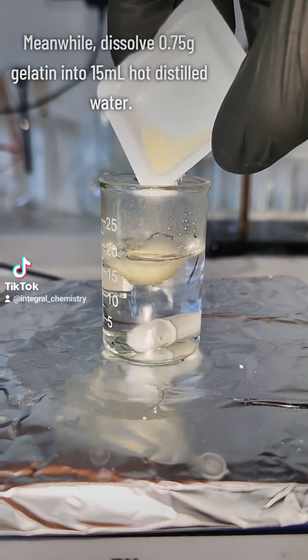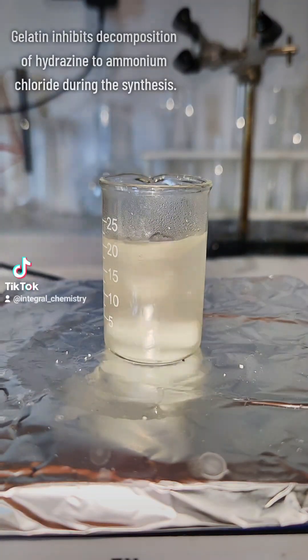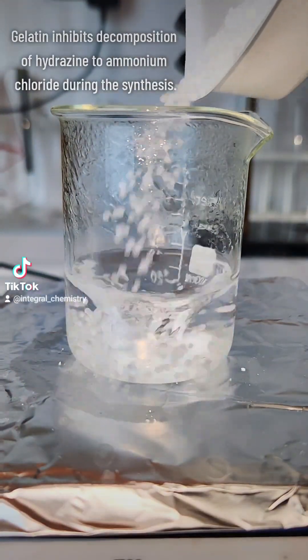I dissolve 0.75 grams of gelatin in 15 milliliters of distilled water. Gelatin is a crucial ingredient here, as it will favor the production of hydrazine rather than ammonium chloride.